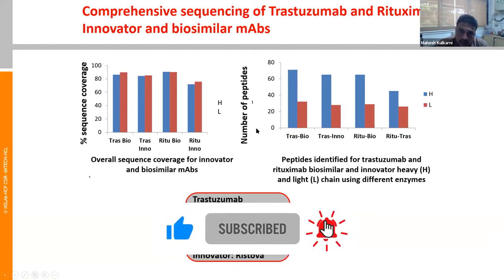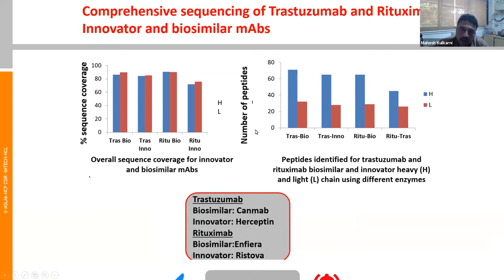With multiple proteases, we could increase the number of peptide identifications as well as the sequence coverage. That's what I would like to highlight on this slide.